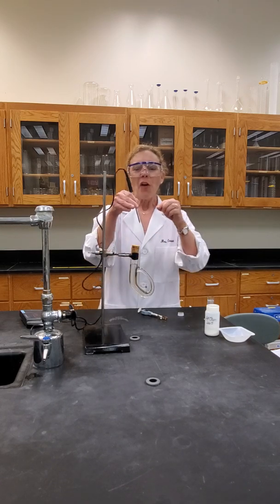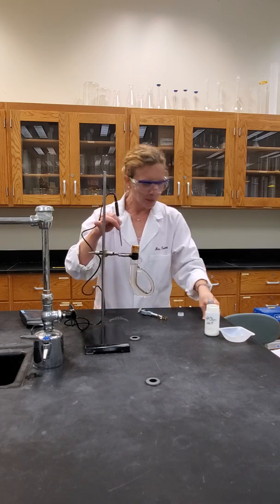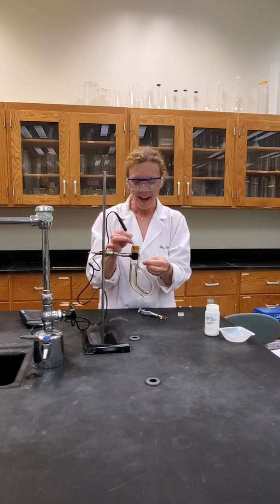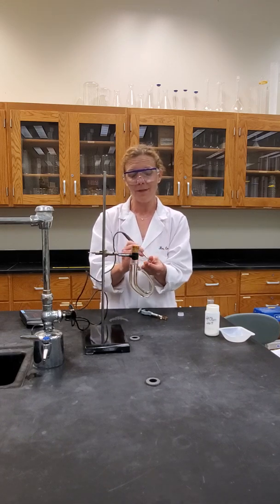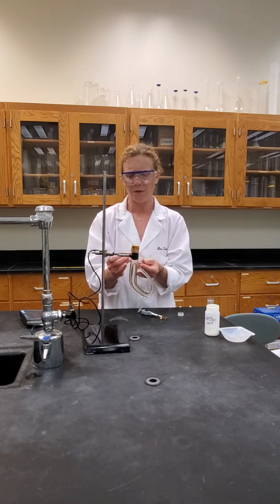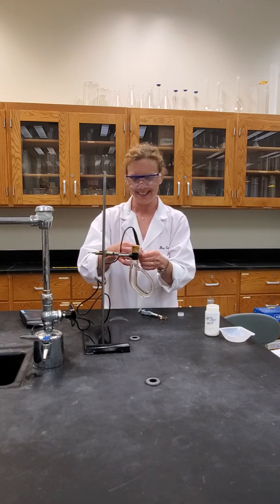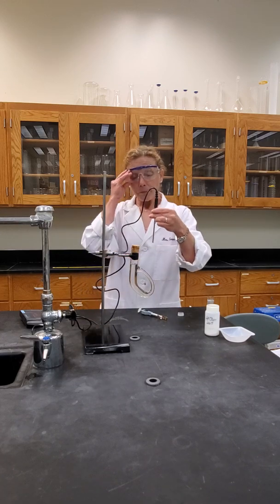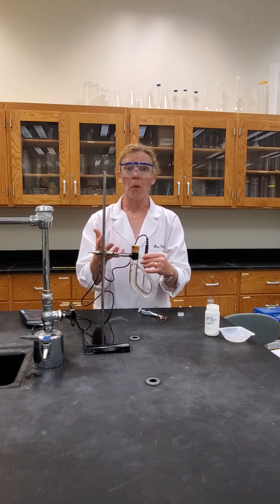So how do we keep the capillary tube to the probe? Well, we're going to use orthodontic rubber bands, which are just really small rubber bands. I bet if you search your bathroom, you'll find some in a nook and cranny from those braces.